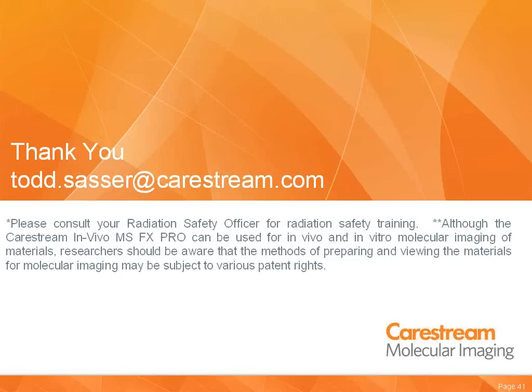It will vary as well depending on the isotope that you're using. The screen is more sensitive for the lower energy isotopes, Tech-99, for example. For higher energy isotopes, you'll have a lower overall sensitivity for detection. Okay. Can we do 3D imaging? You can do Mars rotation imaging, so it's not true tomographic imaging at this time.